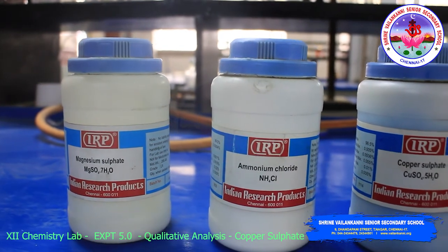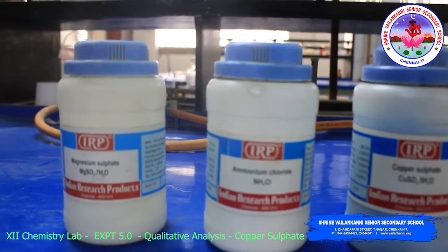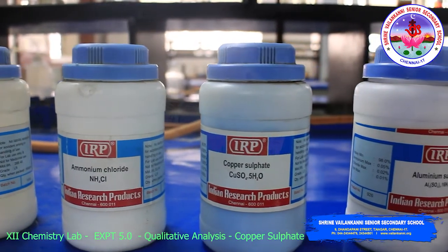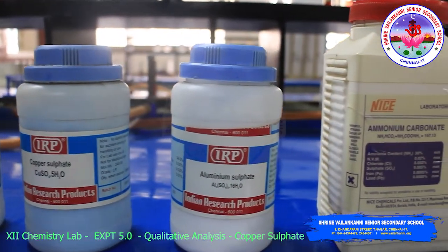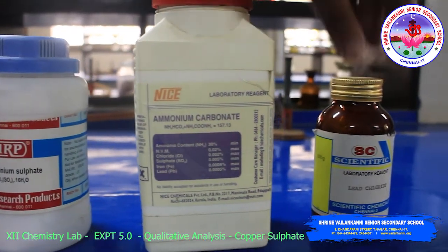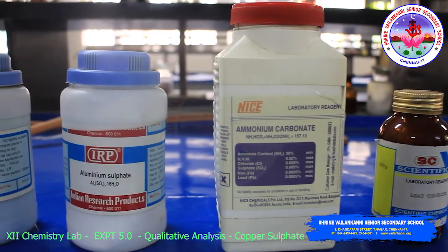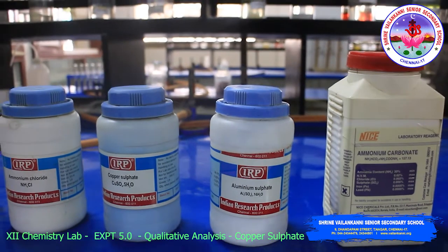Here we are going to do these salts: magnesium sulfate, ammonium chloride, copper sulfate, aluminum sulfate, ammonium carbonate and lead chloride. These six salts we will do the confirmation tests for here, but you have to do the systematic procedure. I will show you the confirmation tests for these substances.